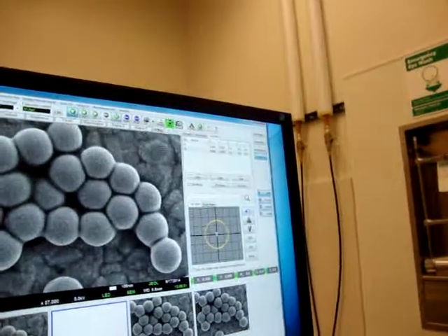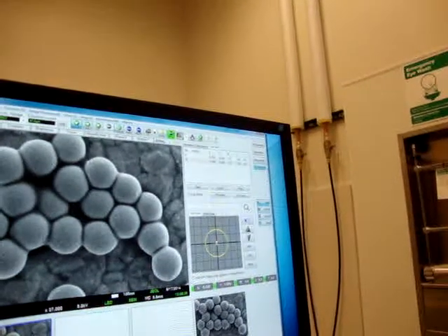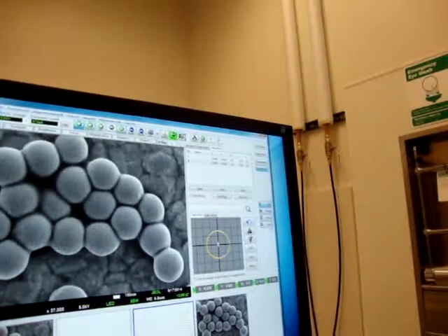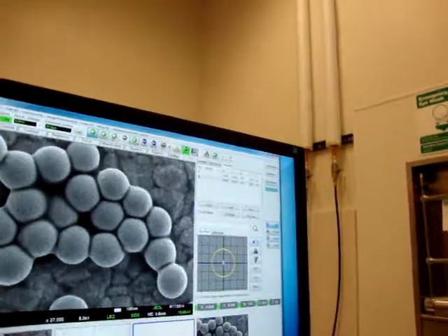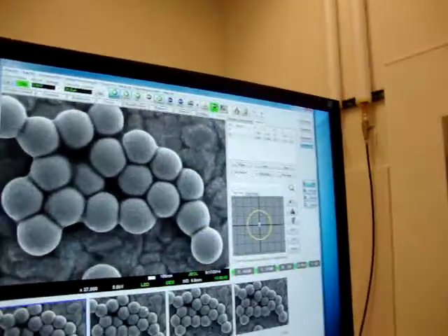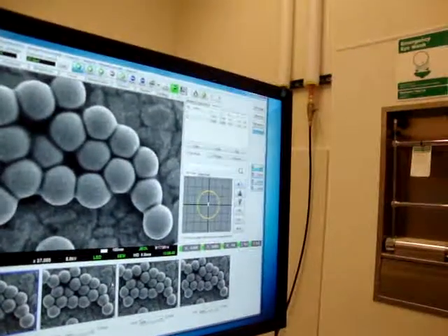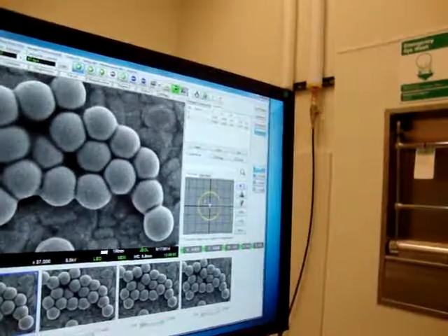Now, under stage, you also have stage navigation. Well, the image processings look the same, more or less. Well, we're not looking at the best samples in the world. Sorry, you were saying something? We were looking at stage navigation, under stage.